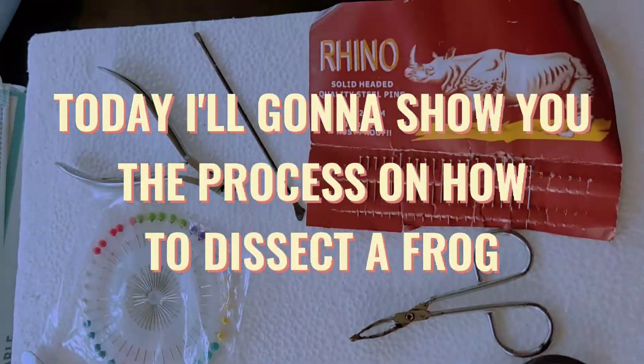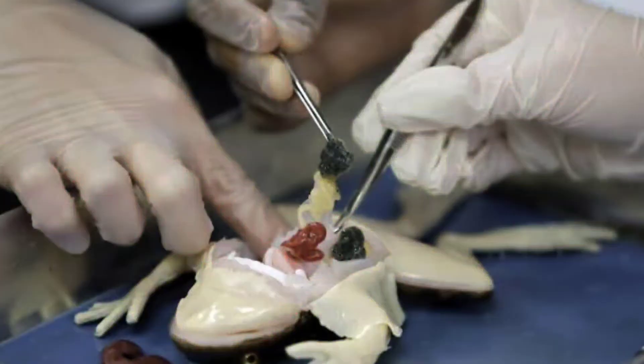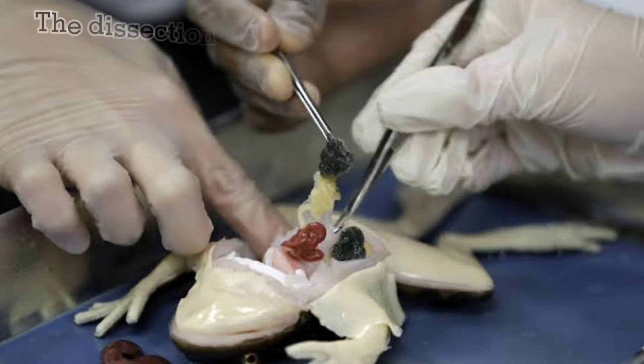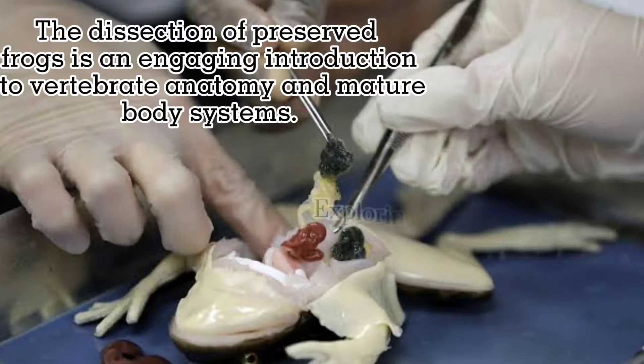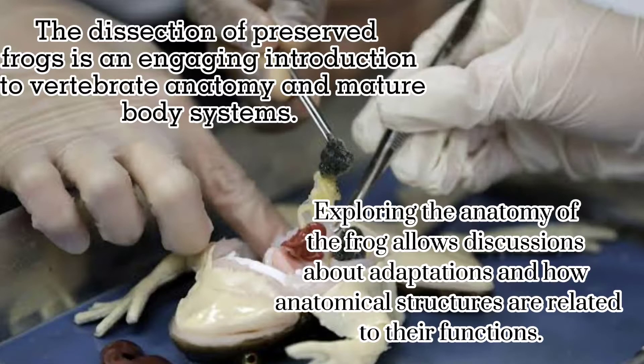Today, I'm going to show you the process on how to dissect a frog. But first, let us know what is frog dissection. The dissection of preserved frogs is an engaging introduction to vertebrate anatomy and body systems. Exploring the anatomy of the frog allows discussion about adaptation and how anatomical structures are related to their function.